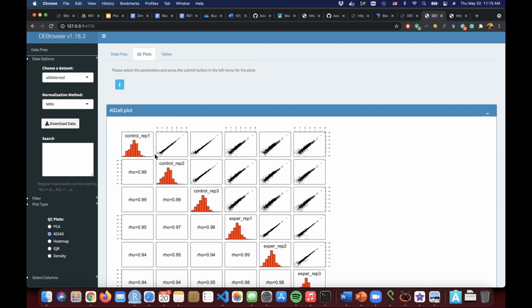But when the gene has a lower abundance, for example, you get 10 reads from that gene, and in two different experiments, you can get like 5 or 10 in this area because there's a huge sampling when you sequence 50 million reads. Think about 10 reads out of 50 million reads, and those 10 reads are in this area coming from that gene.